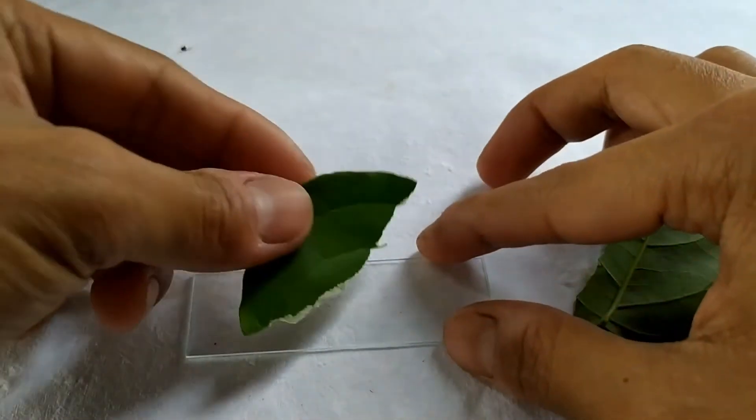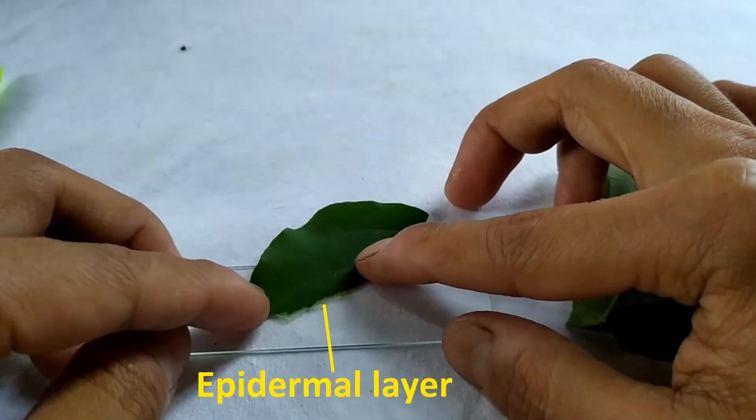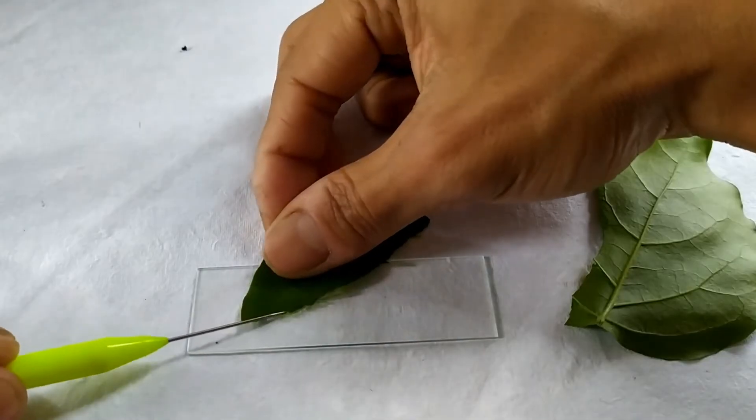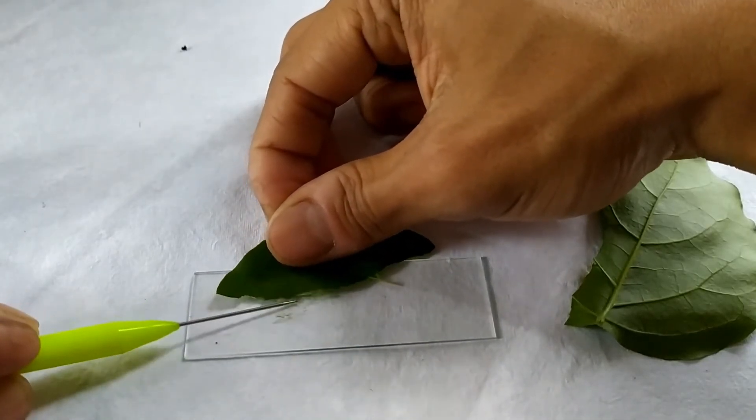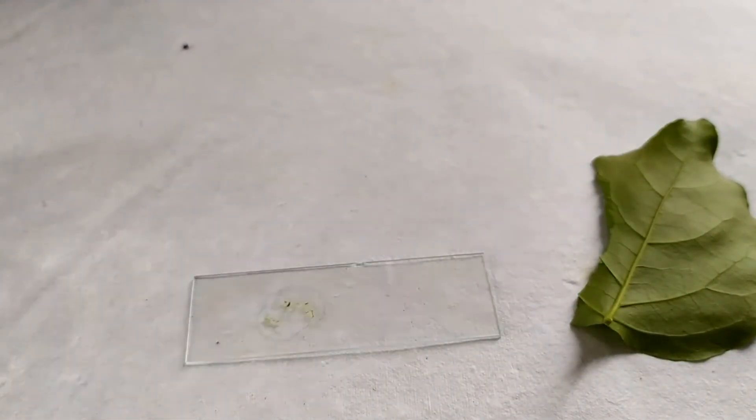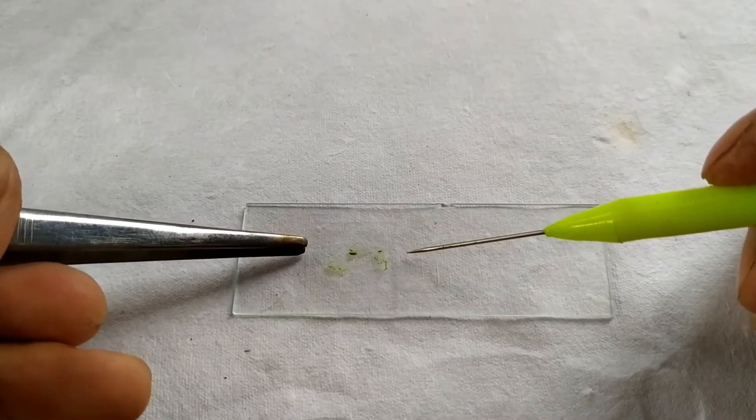If this maneuver has been performed correctly, you'll observe a thin layer of epidermis detaching from the leaf surface as you continue to pull. Immediately detach a fragment of the epidermis using a tweezer and place it on a glass slide containing a drop of water or a staining dye.